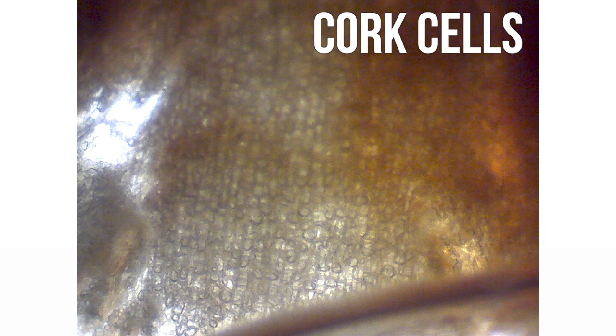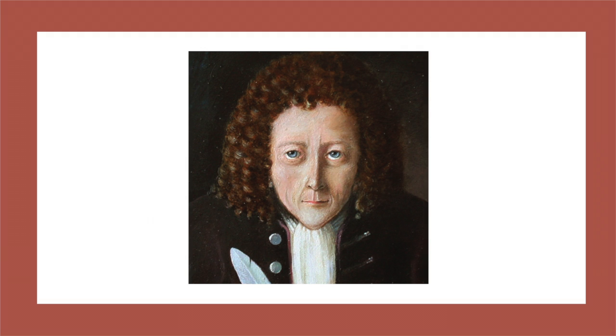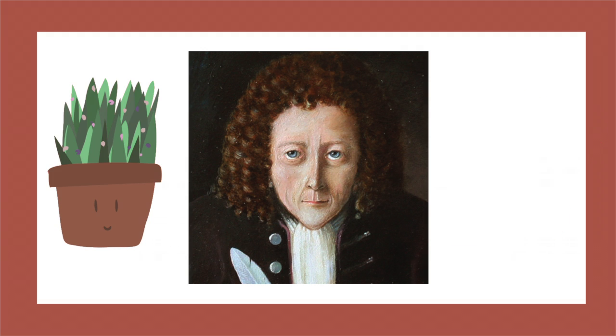Observe little circles in rows organized around the cork. When Robert Hooke saw this, he determined that these must be what make up the cork — the cork cells. Repeating his experiment with other plants and animals, he was able to determine that all things are made up of cells.